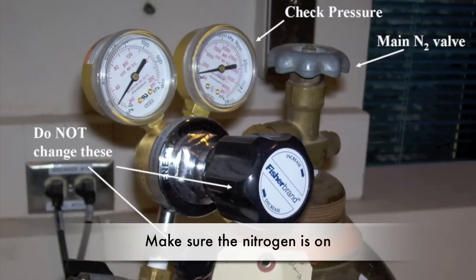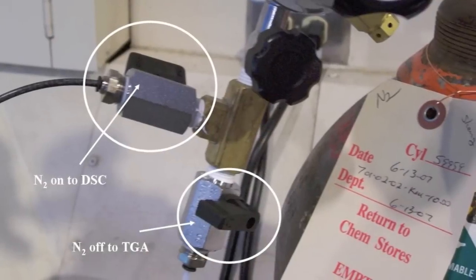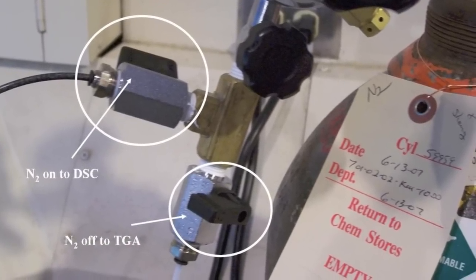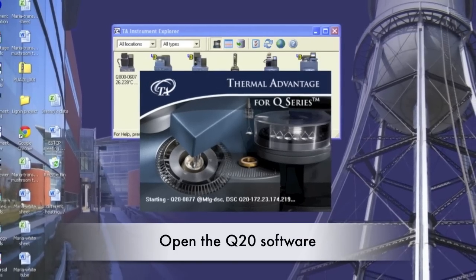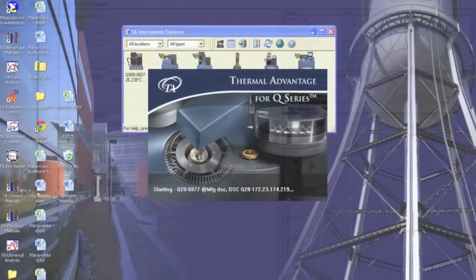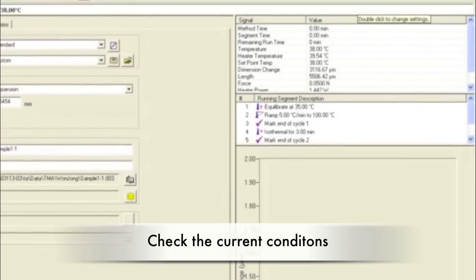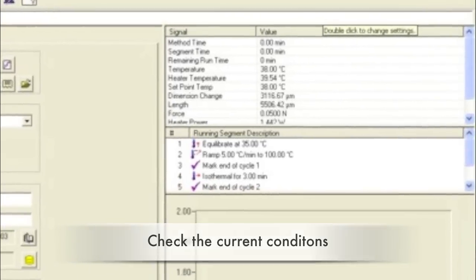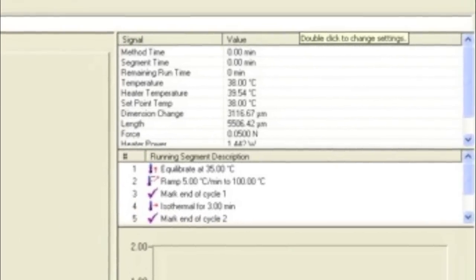Check to see that the nitrogen is on and the knob is open for the DSC. To open the software, click the TA Instrument Explorer and open up the Q20 software. The information in the top right corner shows the current conditions. Check to see that the sample purge flow is set at 50 mL per minute.